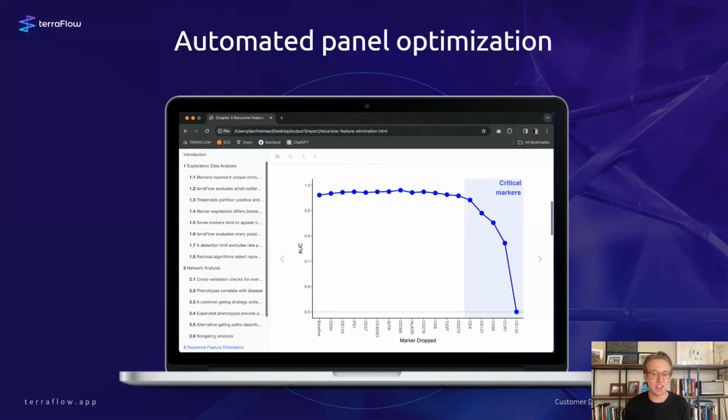And so you can imagine, if you are planning a follow-on experiment, what you can do is cut those non-informative markers and then backfill with a new set of antibodies. Or if you're planning a follow-on clinical experiment, now you can do these on the lower parameter instruments typically used in clinical settings. Or you can just take this at face value and understand biologically what is really the core features driving my patient differences.